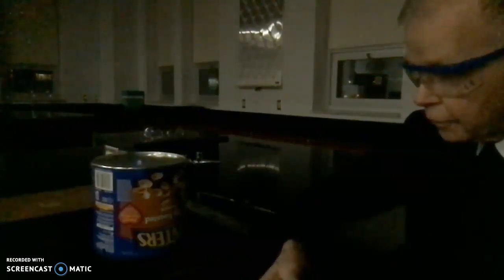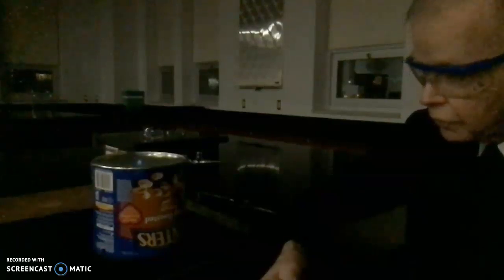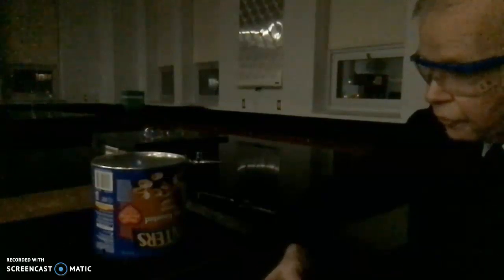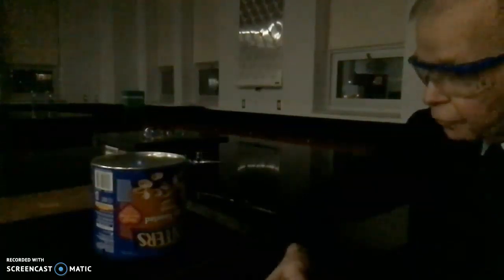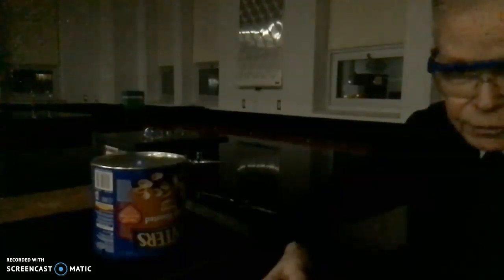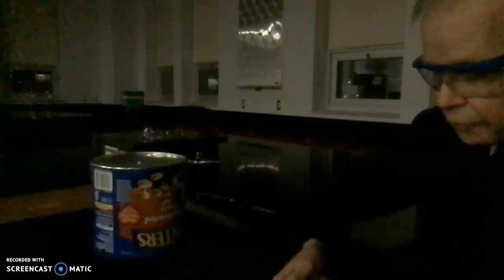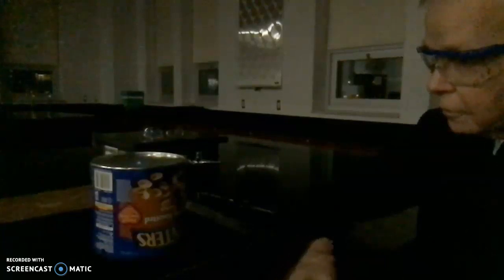I'm going to just stop talking and let the reaction proceed slowly. The flame is now getting closer and closer to the hole, and there's very little flame visible. You might be able to see a little bit on the video, but for me here in the room, I can see that it's getting much smaller. So let me stop talking here, and let's wait to see what happens.